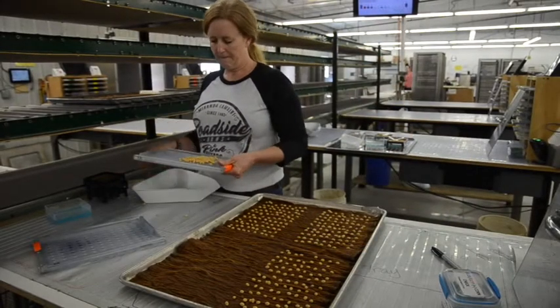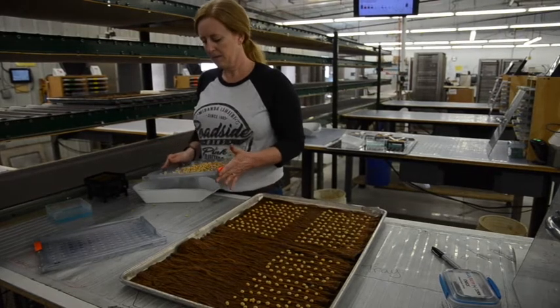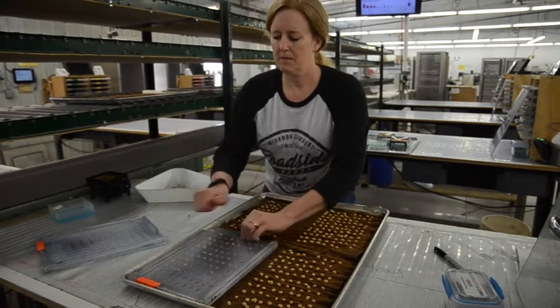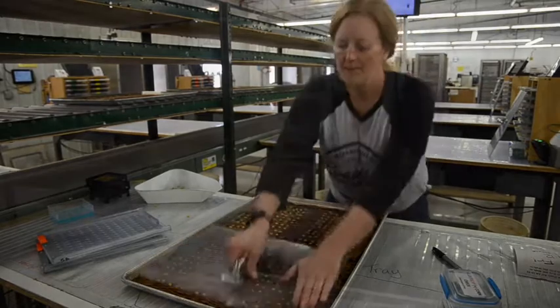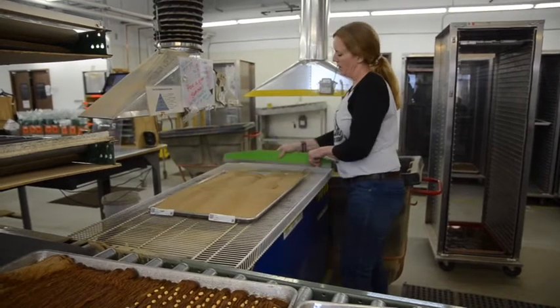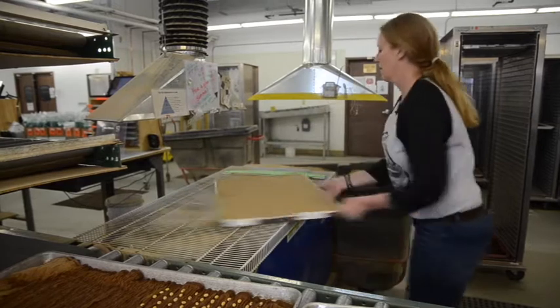For each sample we plant four replicates of a hundred seeds according to the AOSA rules for germination testing. We try to implement as much lean manufacturing as we can into our system. Notice we have a planting line where the trays actually come to the planters. Here we're covering the tray with sand to promote uniform emergence or to reduce secondary fungal infection.